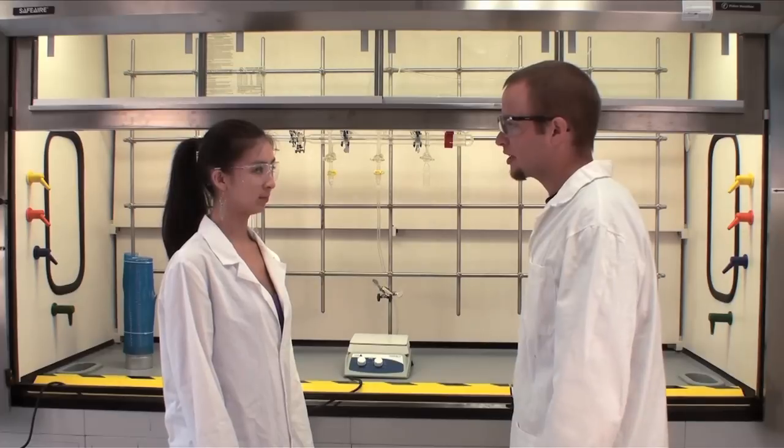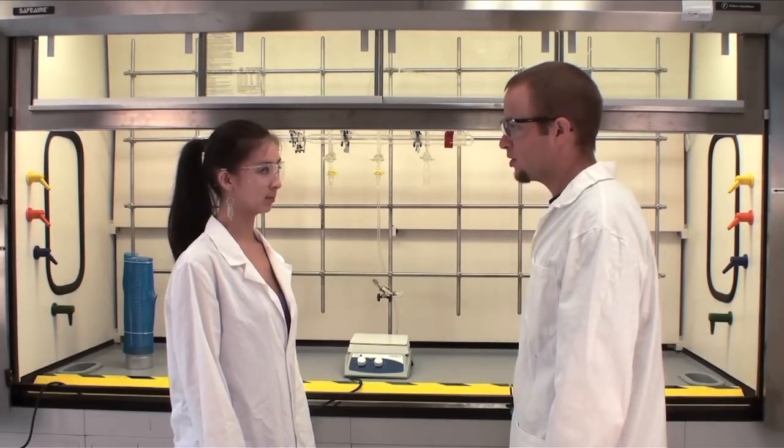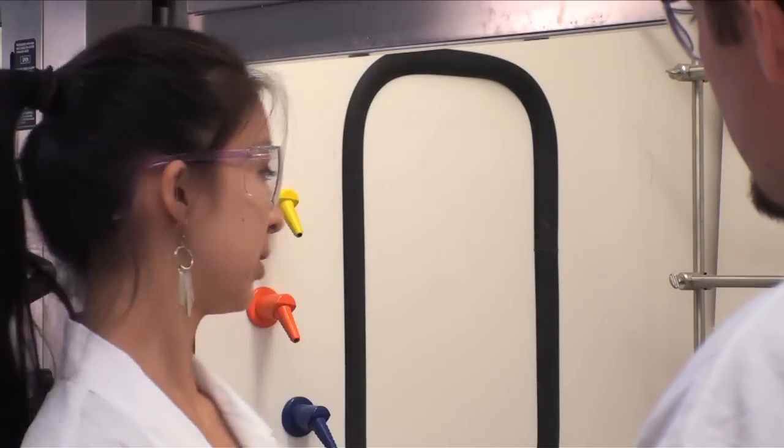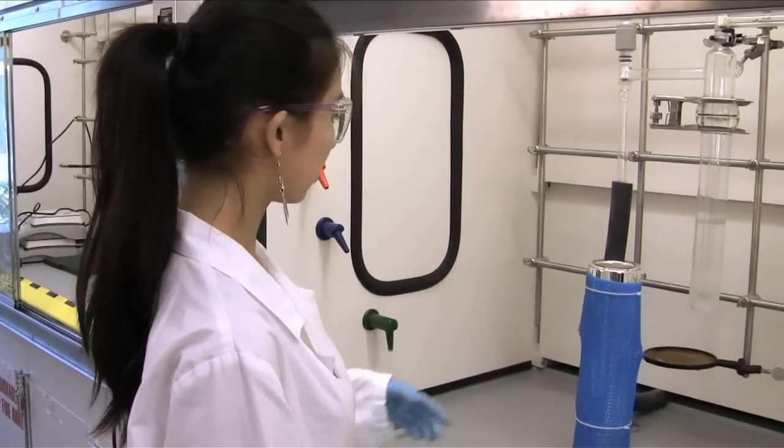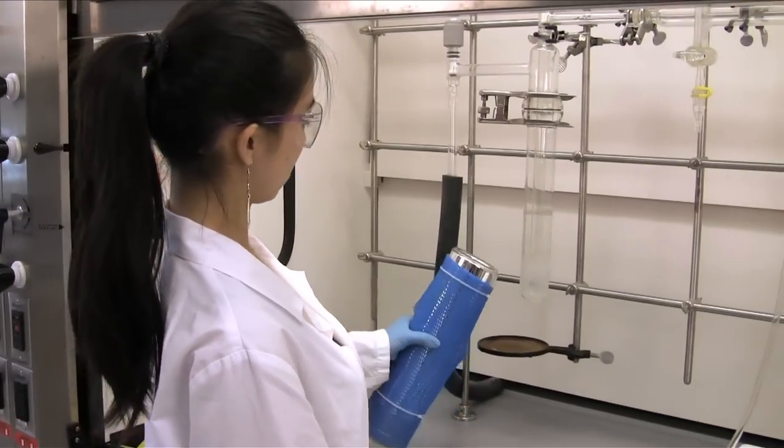Okay, now that we've connected the new nitrogen tank, it's time to turn on the vacuum pump. Do you know what to do? Yeah, I know we need to do things in a specific order. First, turn on the vacuum. And then, cool the trap with liquid nitrogen.